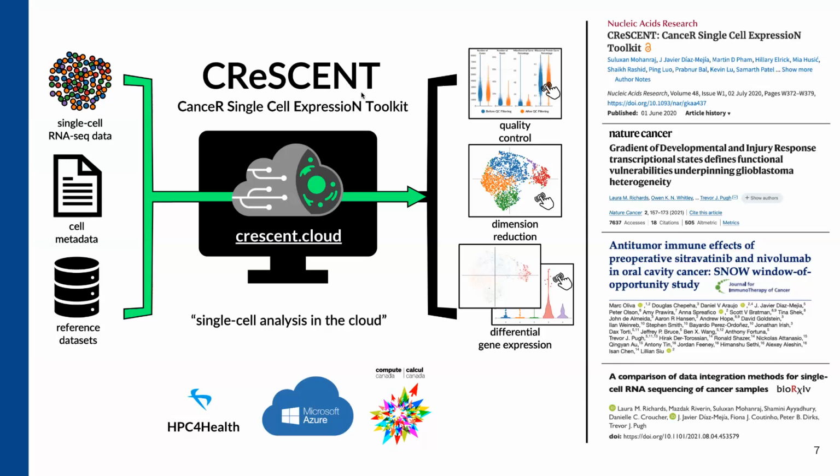Okay, so basically they looked at two different treatment groups. One, a combination therapy, this is for oral cavity cancer, and one, a single treatment option. They wanted to make this immunotherapy therapeutic call, whether the combination therapy would be more effective.